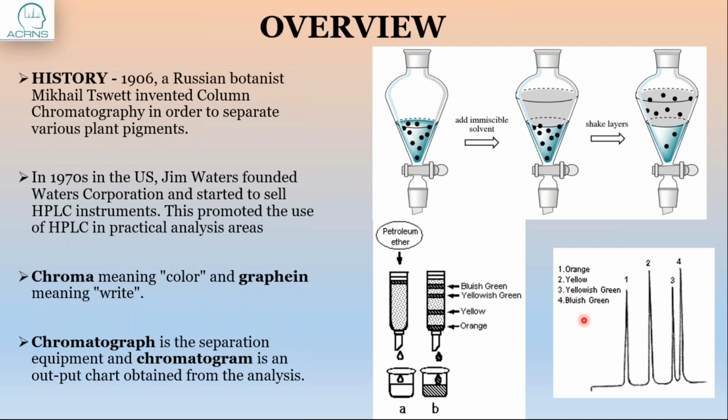This was achieved by the automation provided by Jim Waters, who founded Waters Corporation and started to sell high performance liquid chromatography instruments. This promoted the use of high performance liquid chromatography in practical analysis areas.